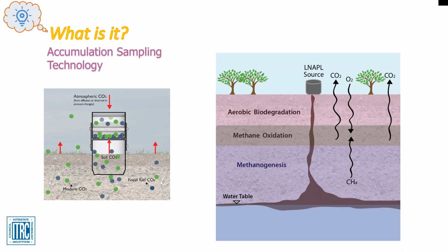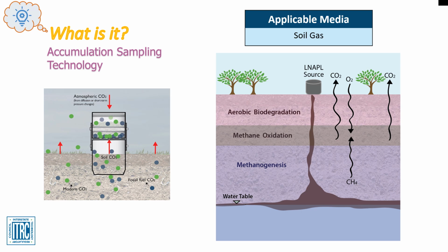The Fossil Fuel Sampler, or CO2 trap, is an accumulation-type passive sampler. CO2 traps are used to measure carbon dioxide in soil gas. The devices are at-grade passive samplers that measure time-integrated carbon dioxide fluxes through the surface at petroleum-contaminated sites. CO2 traps are patented canisters that contain a strongly alkaline, solid-state sorbent material, which converts the CO2 passing through the material into stable carbonates that are retained in the trap.